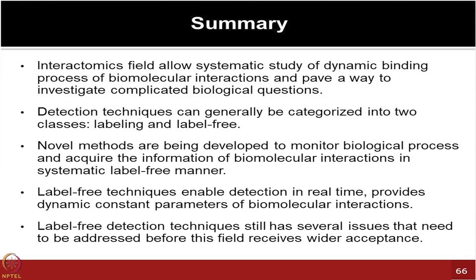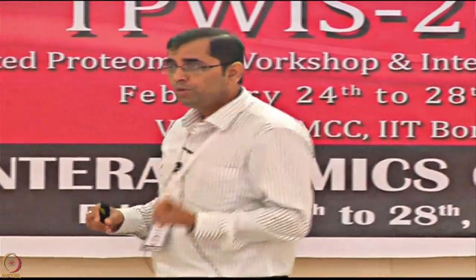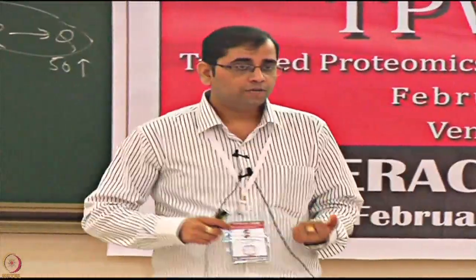I'm sure overall you are probably convinced that there is a lot of potential in using these label-free technologies and the different platforms available, starting from conductance based principles, reflectance based principles, interference based principles. Many of those could be utilized. You can choose which platform can be useful for your kind of application.